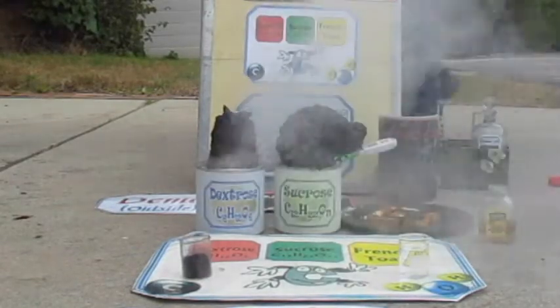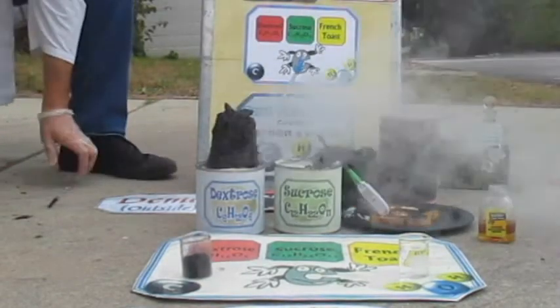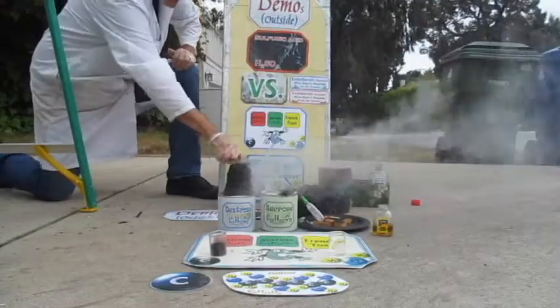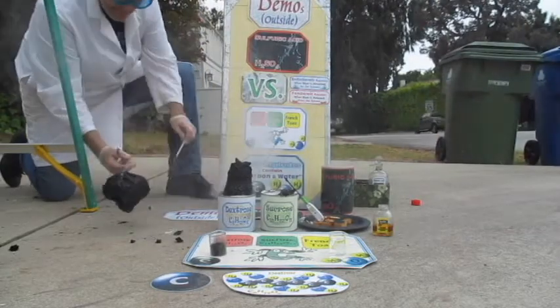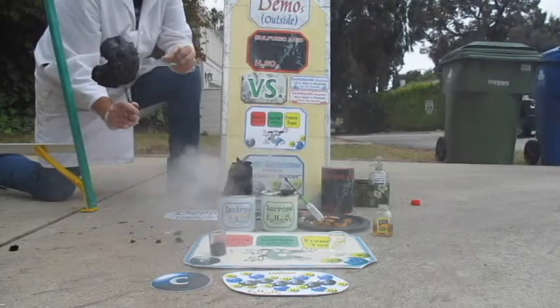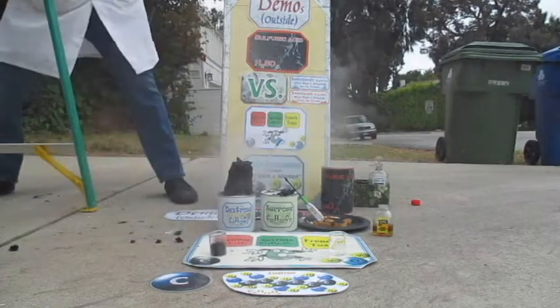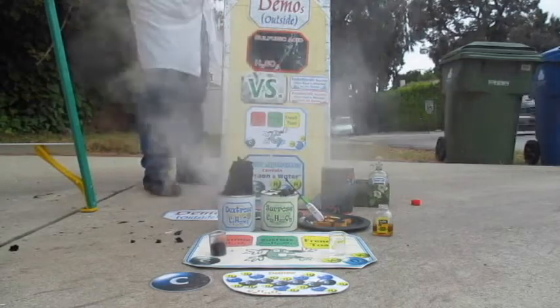So what you see here is carbon. Oh, there we go, good. These are kind of like carbon asteroids, okay? The temperature inside this, let me get this back inside, it's pretty high. It's up to 110. I'm gonna pull that out before it bursts the thermometer. Look at this, it's very lightweight.